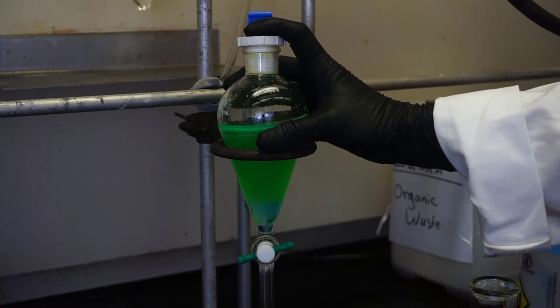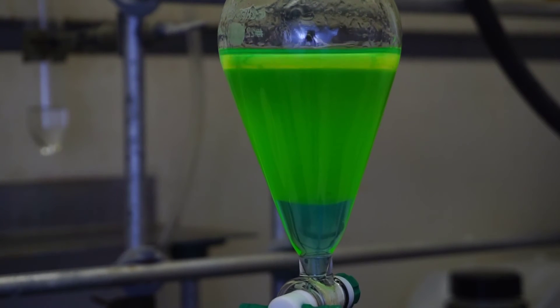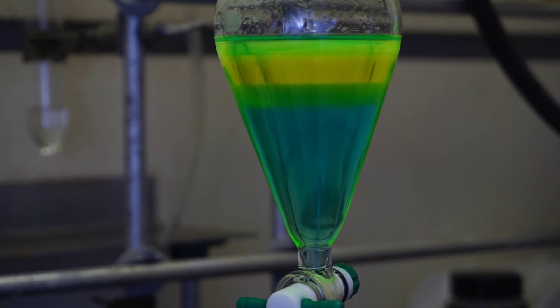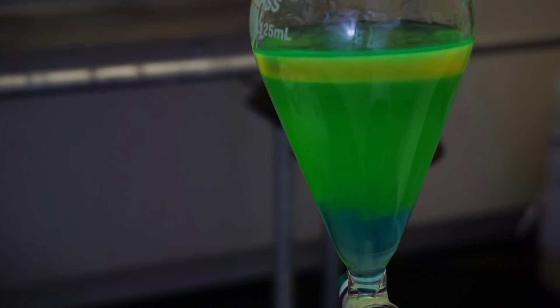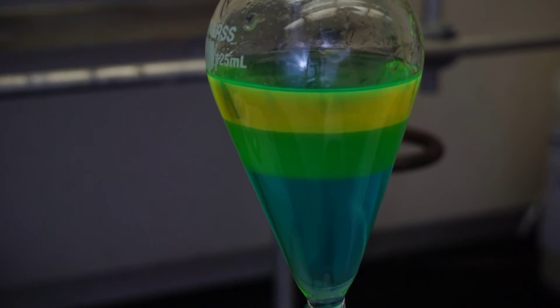Set the funnel down and let the emulsion settle out. The aqueous layer, which is more dense, will reform on the bottom — this layer contains the copper ions which give it that blue color. The organic layer, which is less dense, will reform on top, and the organic layer is the one that contains our product.